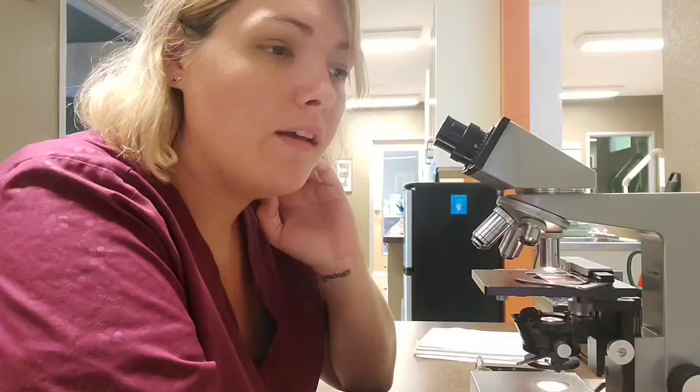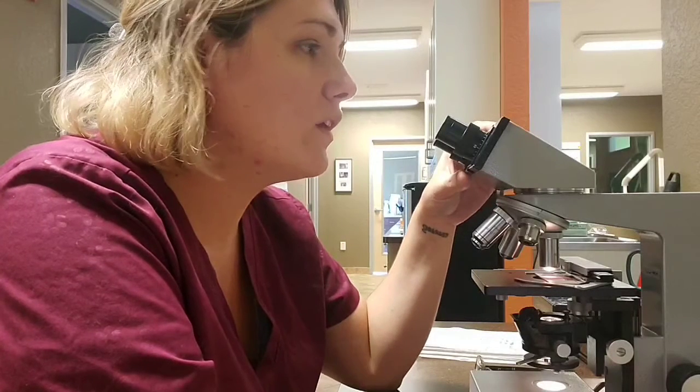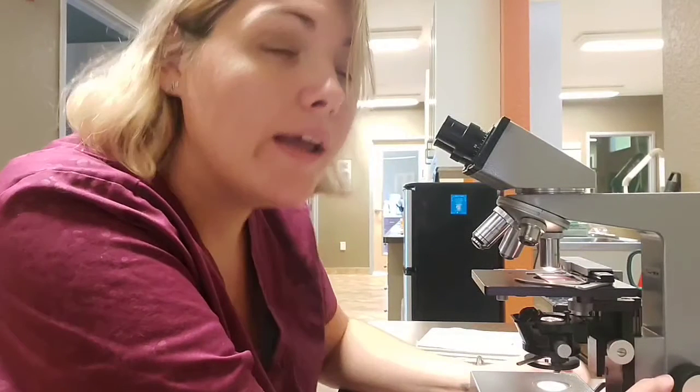One of the things that I could have done is added a drop of saline to disperse things a little bit for me, and spread those red blood cells out to make it a little bit easier to see. But we're also, one of the things that we can get confused with microfilaria is the, I don't think I said that right at all. But that is another microfilaria that we can see in the bloodstream.